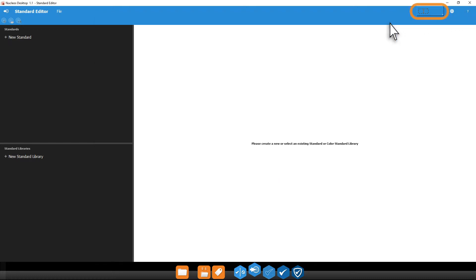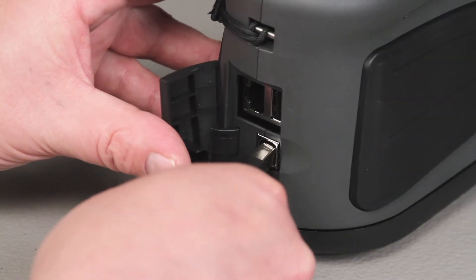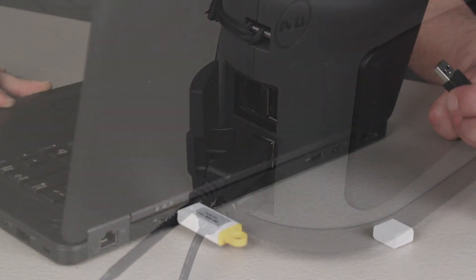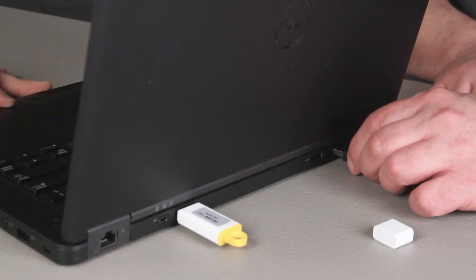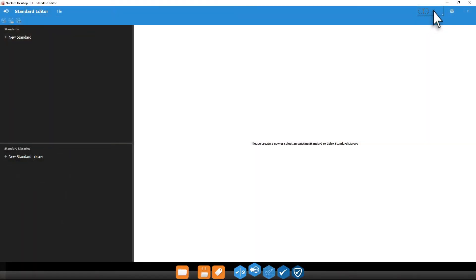Your instrument connection is set right here. Connect your instrument via USB and click Rescan for new instruments. All available instruments will show up here.